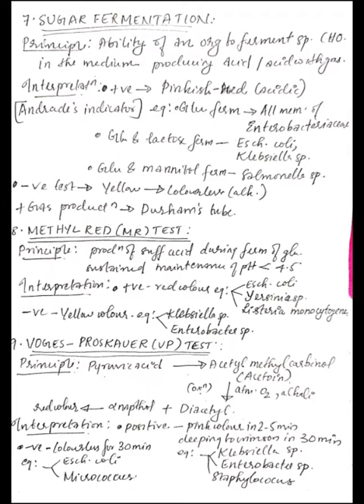This test is positive for Klebsiella species, Enterobacter species and Staphylococcus. The test is negative when the medium stays colorless for 30 minutes. It is negative for Escherichia coli and Micrococcus.